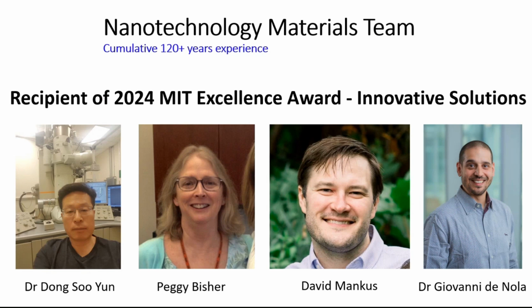And so you do your alignments, your correlation target, then you go in and do volume imaging and decide, okay, now we're going to come in from the back to mill the lamella. And only then, far later in your afternoon, do you discover that glacier. And so you might not have a glacier, or you might. So once we had this, there was no point in ever going back at all.